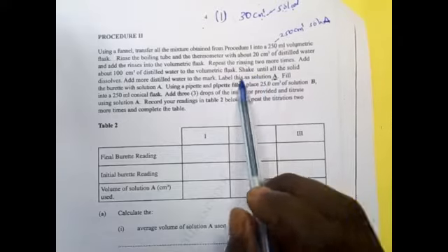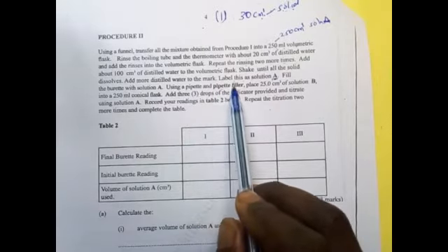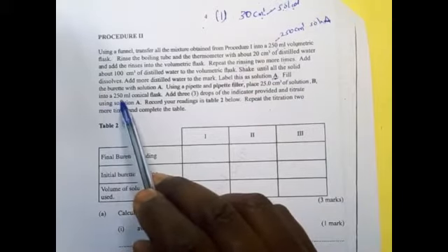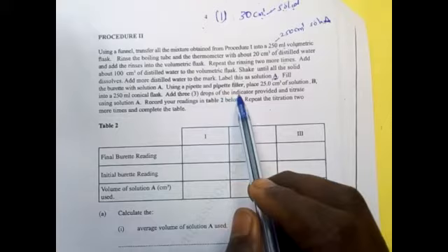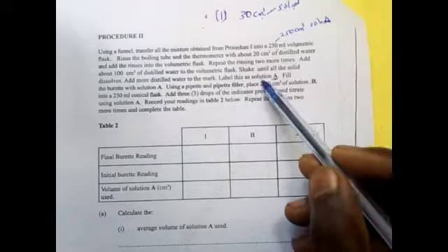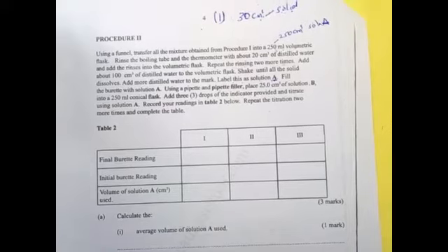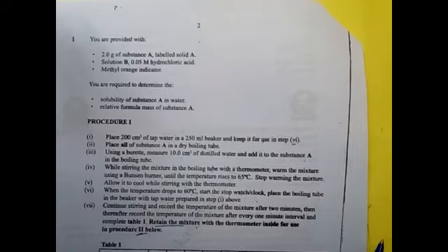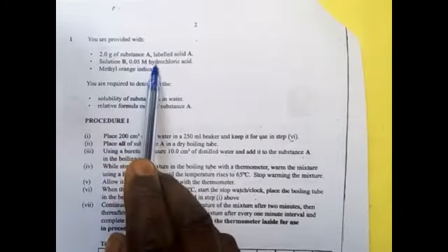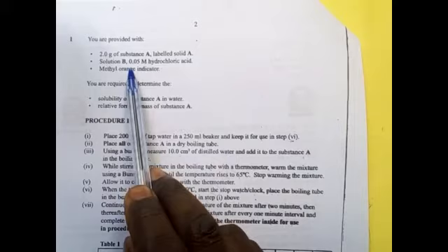Fill the burette with solution A using a pipette and a pipette filler. Place 25 centimeters cube of solution B into a conical flask. Add drops of indicator provided and titrate using solution A. Now we are titrating solution A against solution B, but we know what solution B is: 0.05 molar hydrochloric acid. Now that one we know. So A is going to react with B in procedure 2.